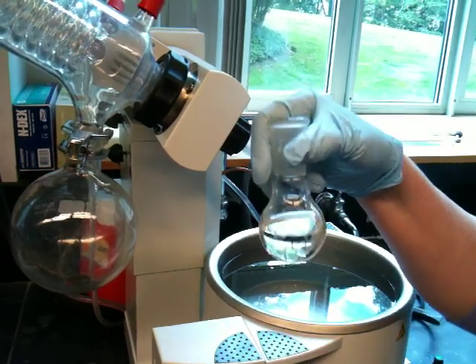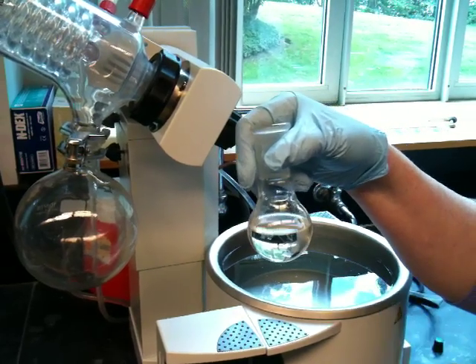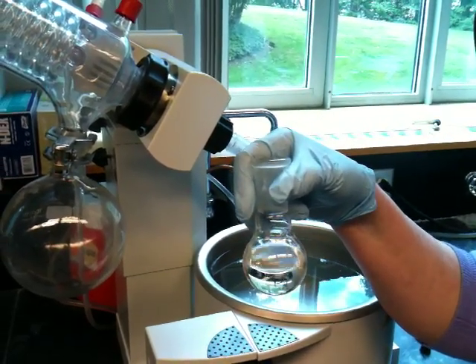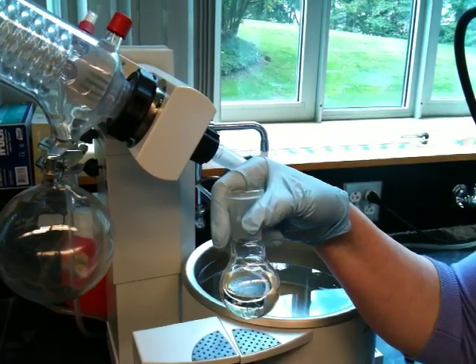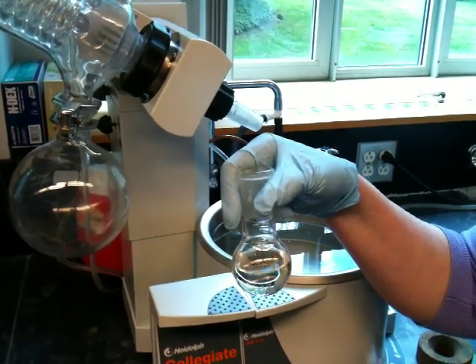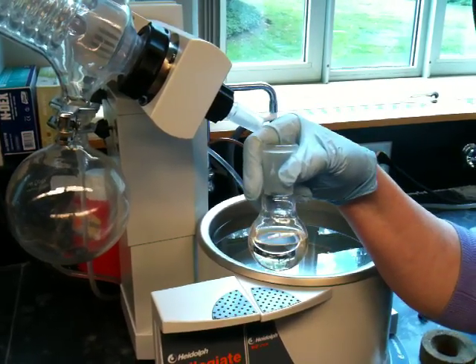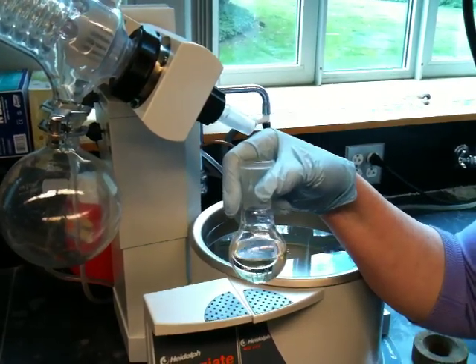So you can safely remove the dichloromethane and leave the compound behind in this flask. Now, this could be done with a distillation apparatus. However, with a distillation apparatus you would have to distill to dryness, and everybody knows what happens when you distill to dryness — you are likely to form peroxides from the reaction of the organic with the oxygen in the atmosphere, and peroxides can detonate when they are dry. So we want to be able to distill to dryness without adding a lot of heat, because it's the heat that produces the peroxides.